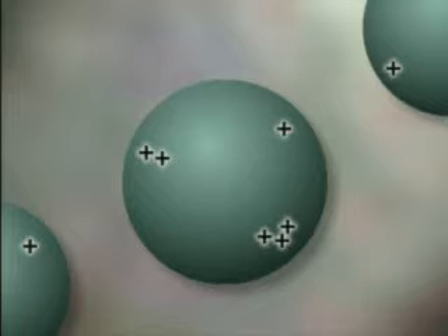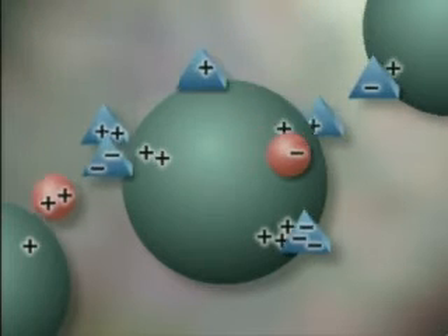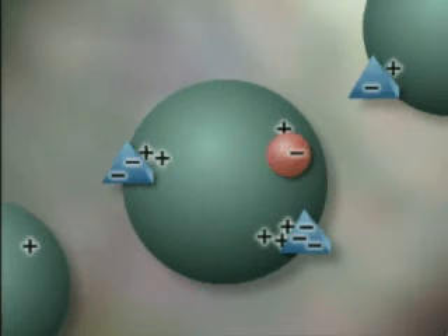The enriched protein mixture is loaded on the column. Proteins having regions of negative charge stick to the beads, and proteins lacking negative charge pass through the column and out the bottom.